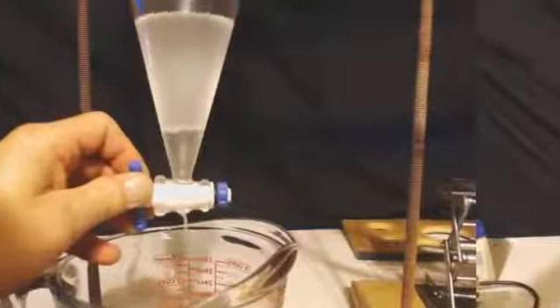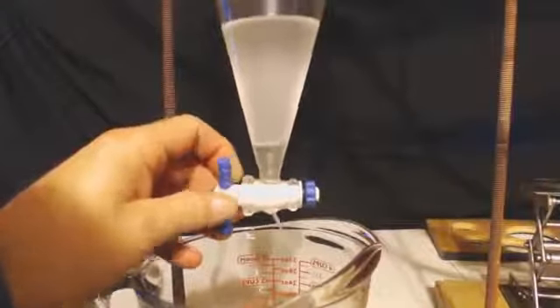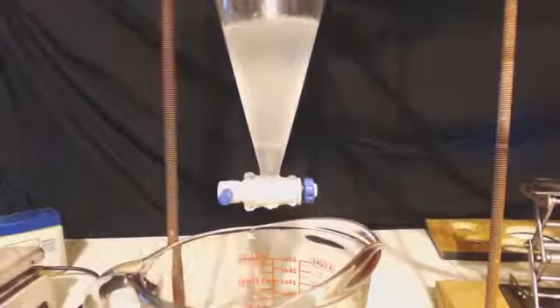Got to dump some more in there. Form two layers. Shake it up. Let it sit 20-30 minutes. And let it flow out. Get rid of that. Now I'm going to do salt water. Throw some salt water in there. Shake it up. Let it sit 20-30 minutes at least.